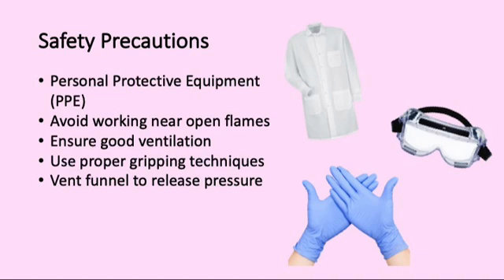Always be mindful of pressure buildup. Be sure to vent the funnel to release pressure by inverting it and opening the stopcock, slowly aiming it towards the fume hood.